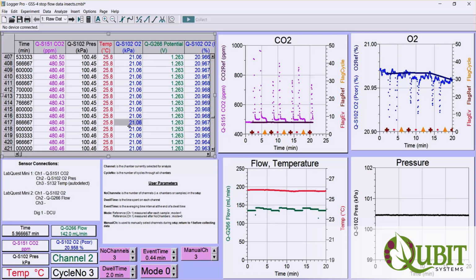You stop the data collection, save it under a name for that day, clear the data, and restart the experiment for the next day. This way you will have smaller data files for each day than one big, large file. And if anything goes wrong, like a power outage or the computer going down, you don't lose all your data. So saving daily, restarting your experiment, and saving frequently while you're running experiments is a good idea.